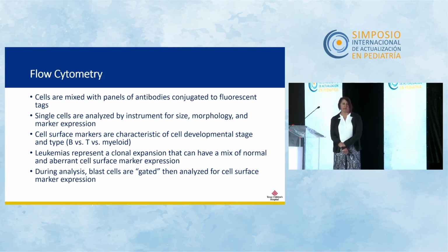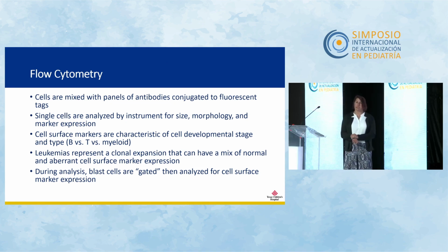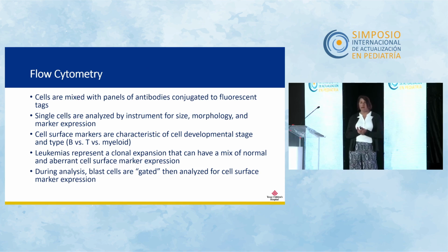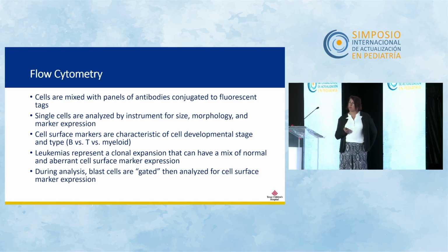But those cell surface markers are different in those different stages. And so flow cytometry interpretation for leukemias is really about pattern recognition. So does this sample look like a wide number of cells in normal development, or do we have this abnormal population that might be our leukemic blast? Remember that leukemias represent a clonal expansion, and so you might have a mix of normal and aberrant cell surface markers. So if you have all kinds of markers that suggest this is an early pre-B cell, well, that's probably a cell that was stopped at that stage of development and clonally expanded. And so you'll have those normal cell surface markers, which can tell you kind of what stage this leukemia is at, but we'll also have some aberrant markers. And these are really important for following disease. So if you have an unusual marker that wouldn't normally be found on an early B cell, you can follow that through treatment and figure out what percentage of cells are still present.